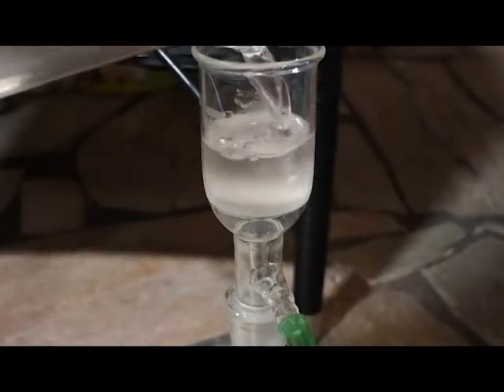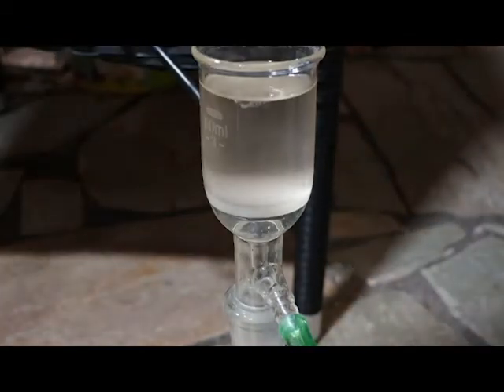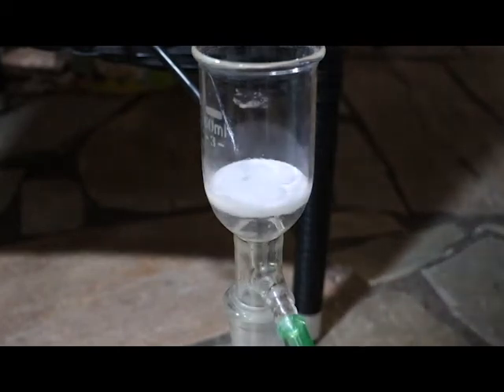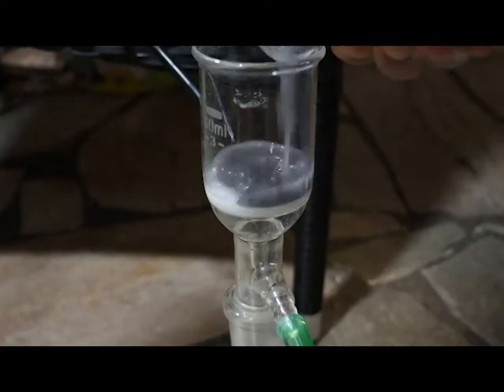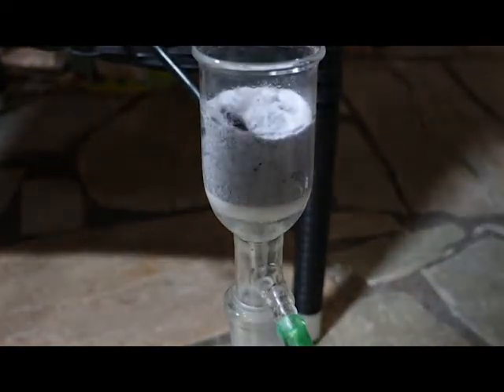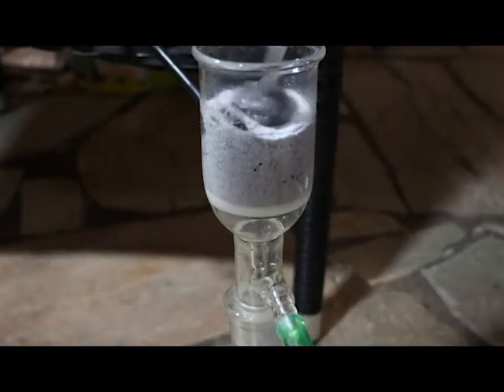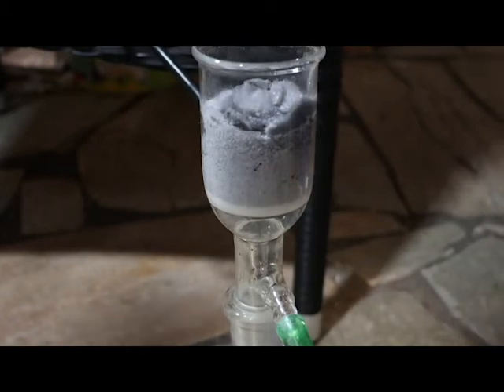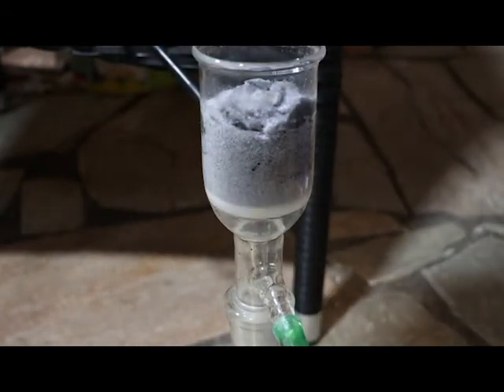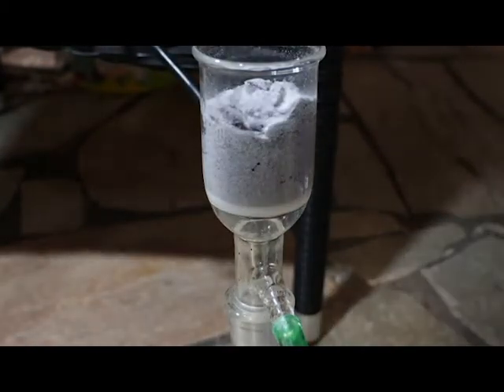Then we perform a vacuum filtration to get our oxalic acid. As you can see, when sucked completely dry, it is nearly white, it's very slightly gray, so the impurities aren't that much, it's just a very small amount. And the black spot that you can see in there is my stir bar. There were some other black spots in there, but they were really easy to get out after filtering. But as I said, normally this shouldn't happen when you perform this.